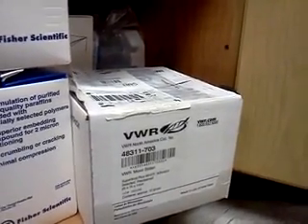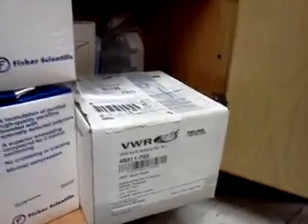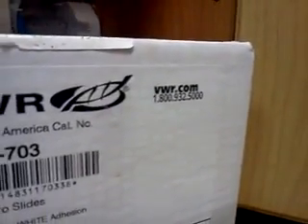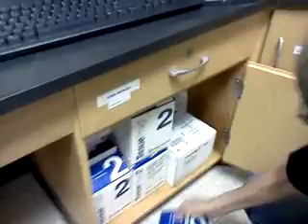VWR North America, 48311-703, that's the product number? Okay. All right. And that's the phone number, 1-800-932-5000. Okay. So you get a whole box of them, and so I would recommend getting those. And then you're going to need cover slips probably. So I would suggest getting those.